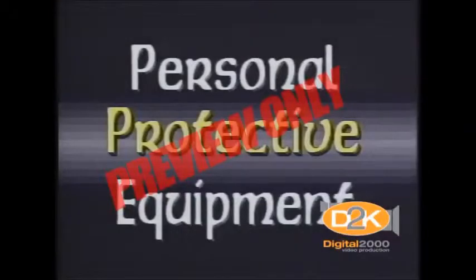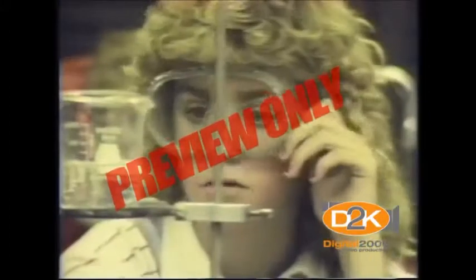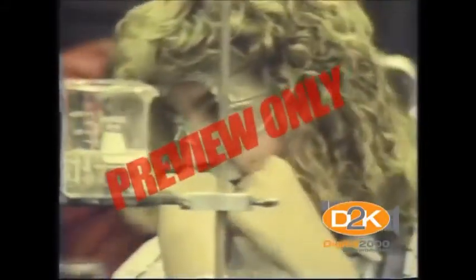Okay, now let's talk about protective equipment that's issued to you to reduce both physical and health hazards. Eye protection comes in many forms: safety glasses, goggles, and face shields. These items are designed to protect your eyes from hazards. They won't do you any good if you don't wear them when required.